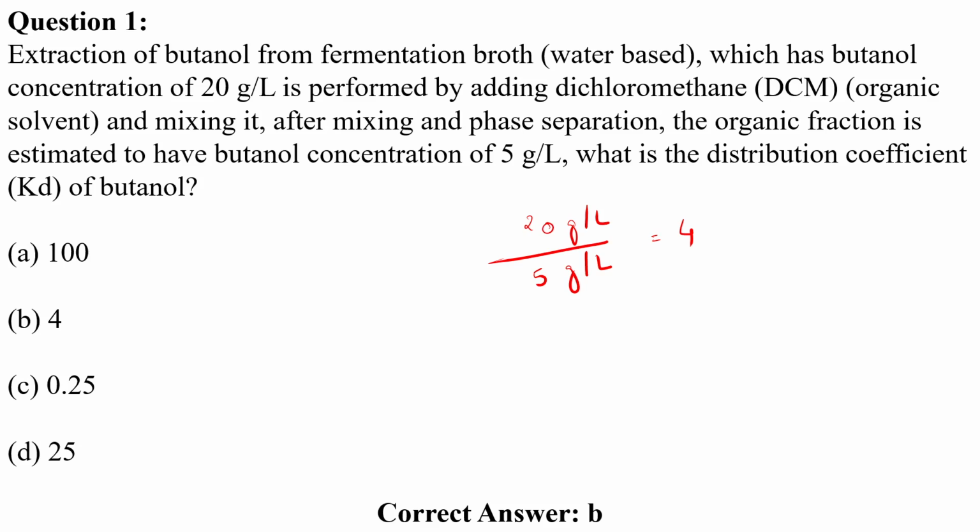So your aqueous phase, the starting material, automatically becomes phase A, because butanol was initially in the aqueous phase.